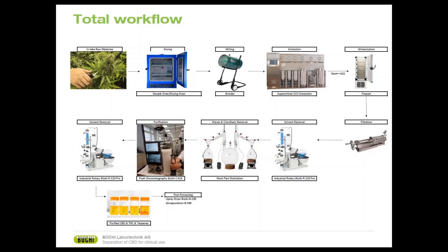This oil will be given into reverse phase chromatography, and then all the cannabinoids are separated using a customer-tailored special method. Again, we need to remove the solvent after purification because we will address more detailedly later on, but we use ethanol and water while we separate our cannabinoids. During this step, we can decide our end product purity.